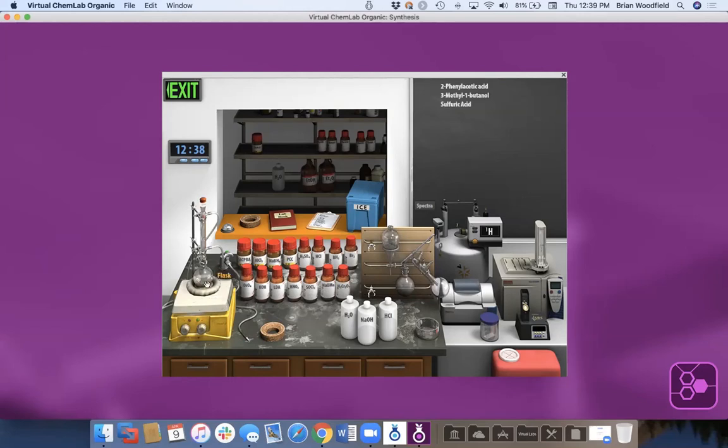And so we have the kinetics, first or second order. Almost all of them are second order. All the second order kinetics and their rate constants are based on temperature. So I can also do a reaction with ice on it as well. We also have to put on the nitrogen. So if I were to not put the nitrogen and run this reaction, this would probably blow up in about 30 minutes after building up some pressure. So all of the different permutations are allowed here. So the idea is, what starting materials do I need? Notice it's not quantitative. I didn't weigh out or measure the volumes.